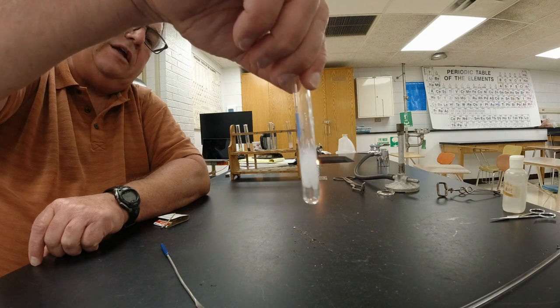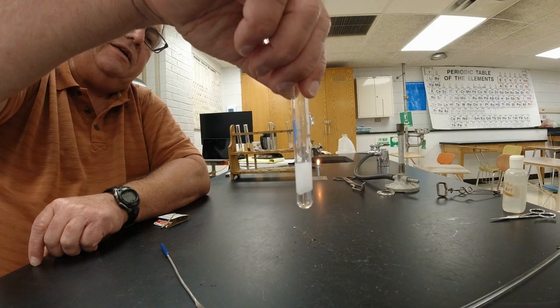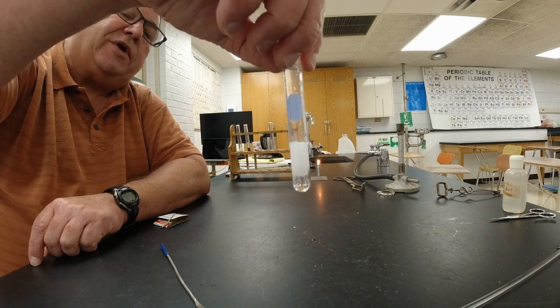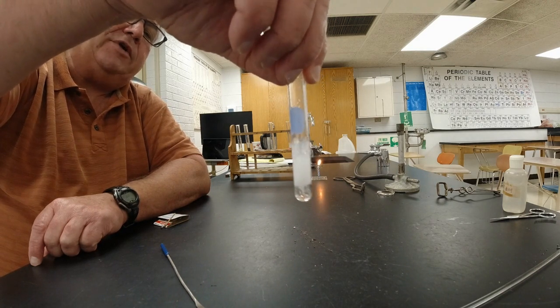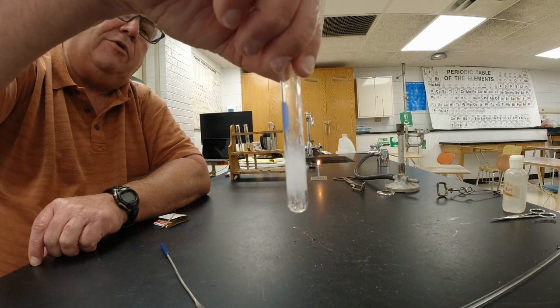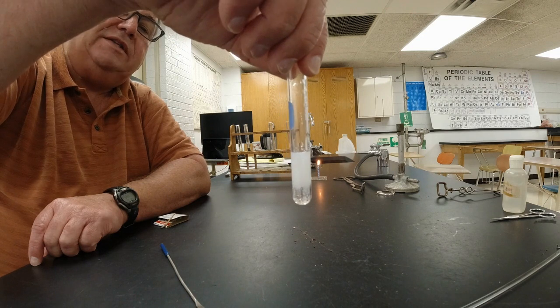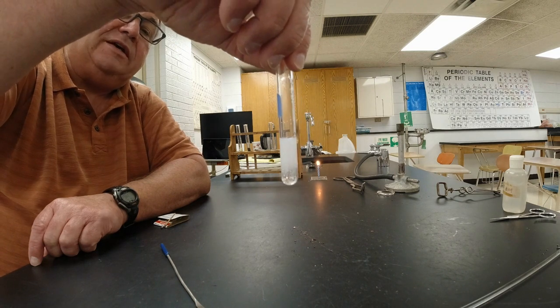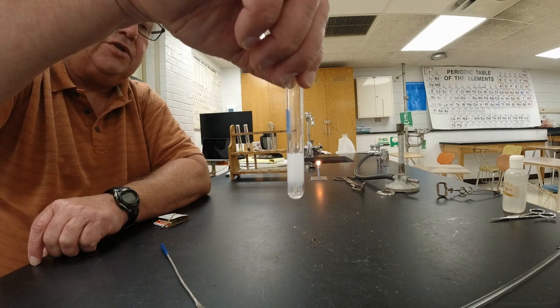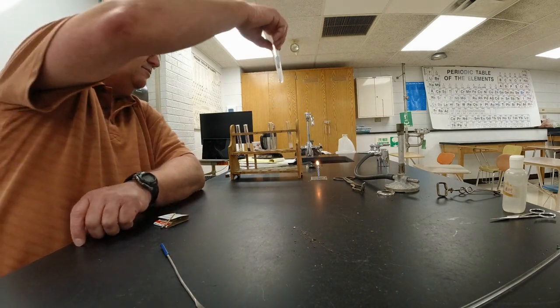If I stirred that all up and I mixed it like that, there would be white chunks of solid that weren't in there before. So there's a reaction going on between the silver nitrate and the calcium chloride, or excuse me, sodium chloride that's in the water. And we can tell that there's a new substance formed because you see a white solid that formed. Right? If you need to pause and write things down, do that.